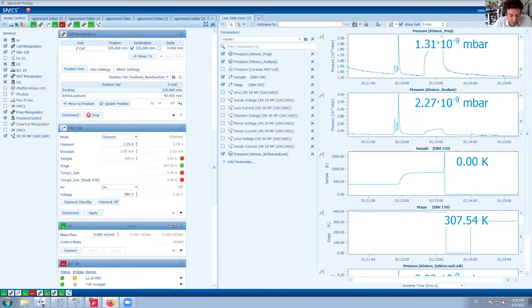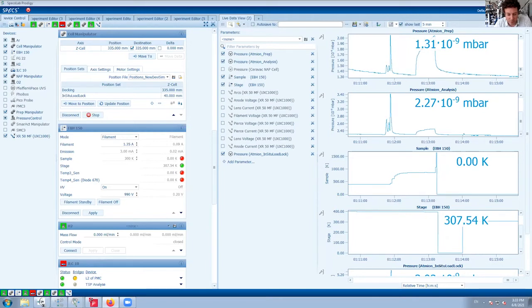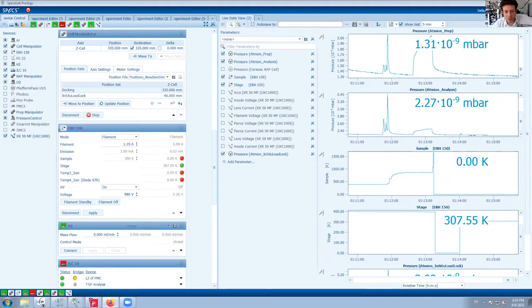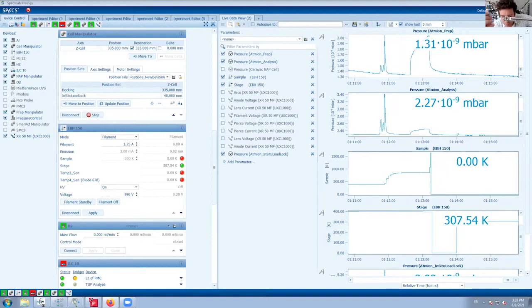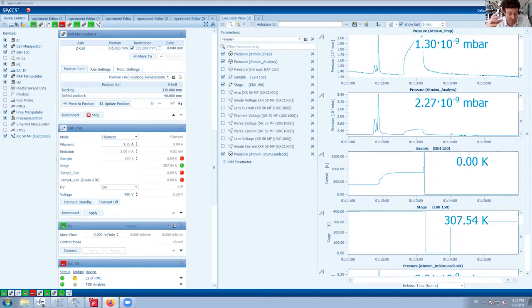But for the heating, we always press it in the mesh, and we have very good experience based on that. You can also use a pellet. If you have a pellet that is quite strong, very well pressed, and your material is conductive, then we can just put the pellet on the sample holder and use those strips to cover it. Of course, you cannot screw it too much because you would break it. So mostly people are bringing the sample in powder form, and we are pressing it here.